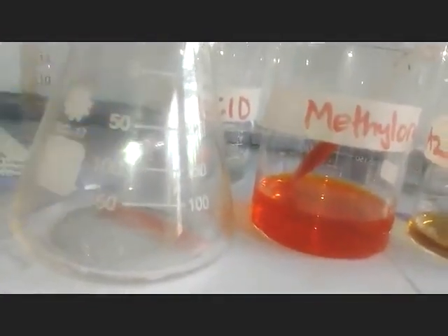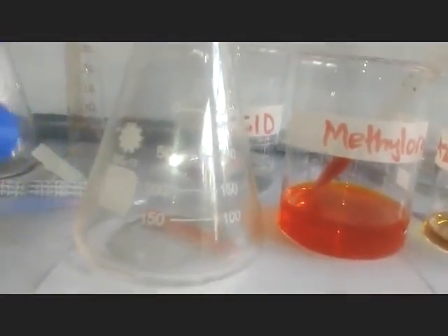Litmus, as teachers told you, can show us whether something is acidic or basic. Blue litmus in an acid turns red. So I get my blue litmus, I put it here, members. You can see that the solution has made the paper which was blue turn what? Turn red.